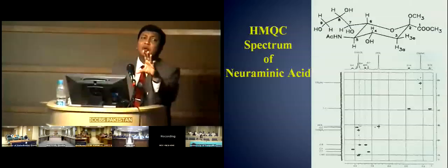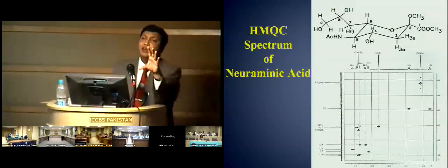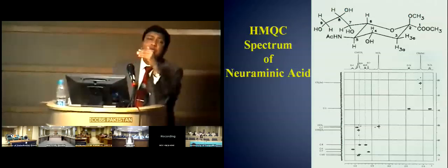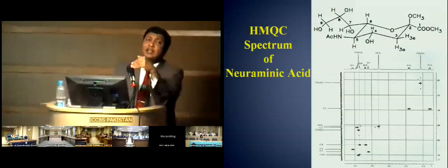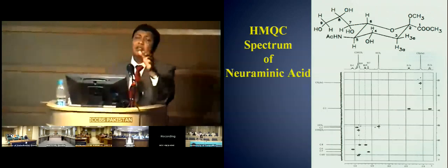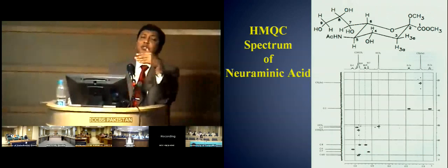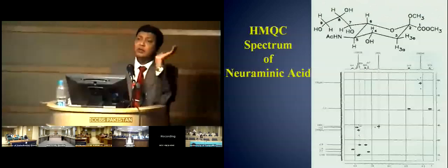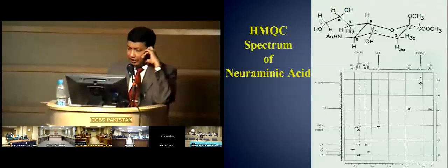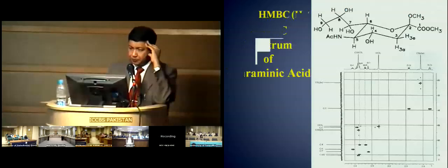There is no pulse sequence, there is no energy level which can allow a proton to go from alpha alpha to beta beta. This is always through alpha beta and then beta beta. So multiple quantum is a technique through which you eliminate the possibility of looking into carbon, and this is a relaxation mechanism which we will discuss in a short while.